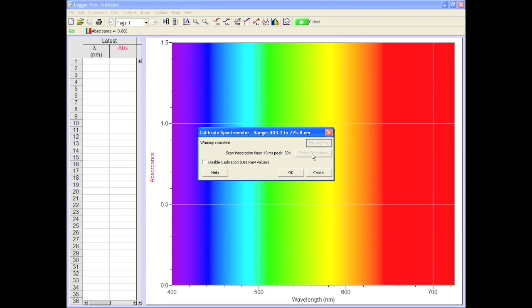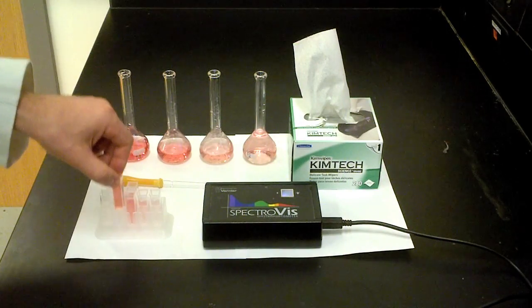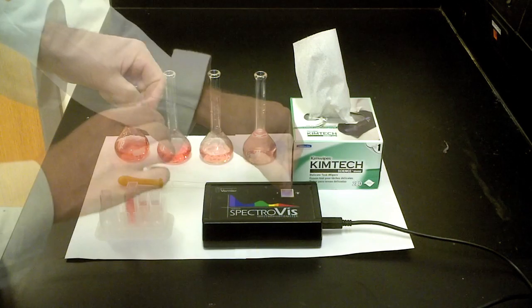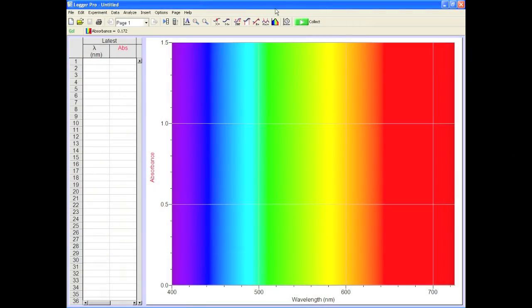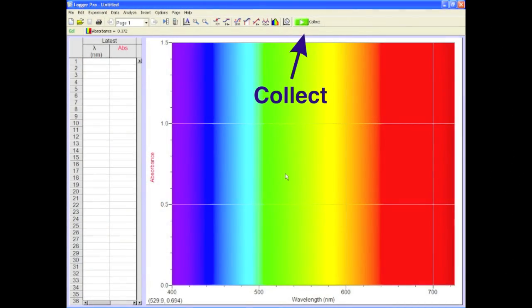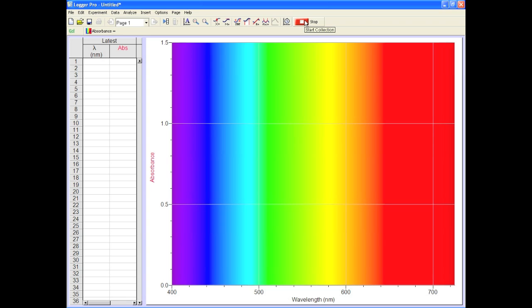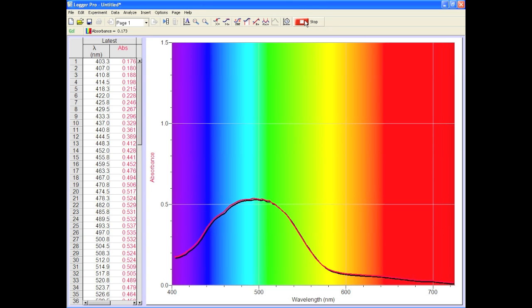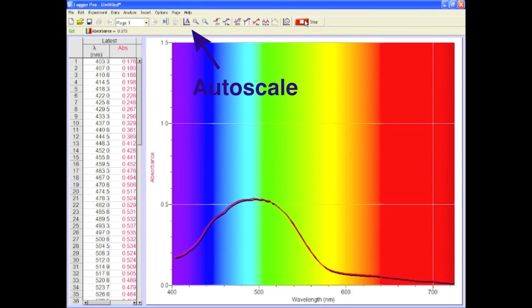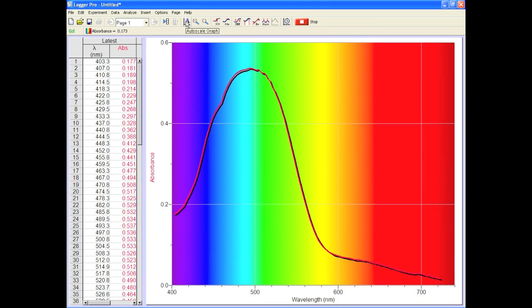Now you'll need to find a suitable wavelength for your experiment. You can't just choose one willy nilly, that's not gonna work. Place a cuvette with your highest concentration standard in the spec and press Collect. Now you get this funky graph showing the absorbance of your sample at different wavelengths. See? This one absorbs most in the blue-green area of the spectrum. Autoscale that bad boy and press Stop. It's a good idea to print a copy and stick it in your notebook.